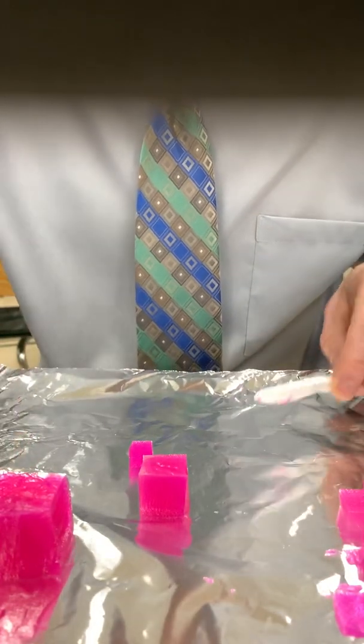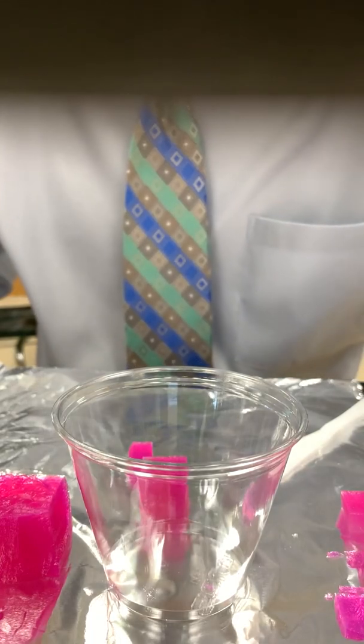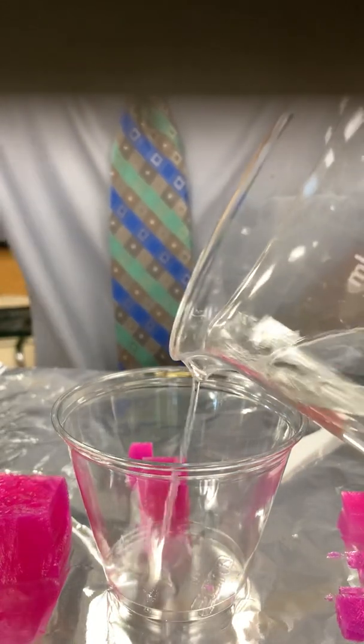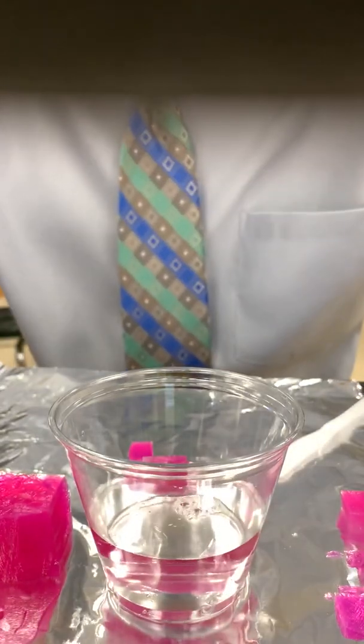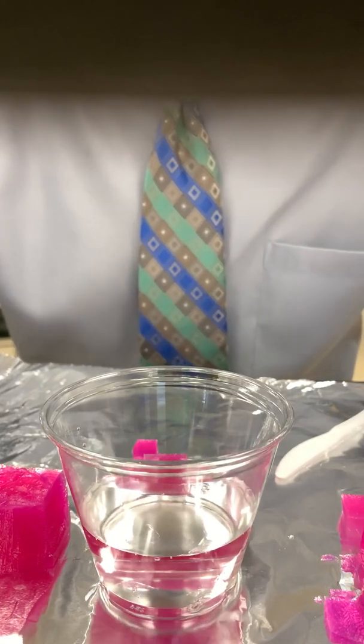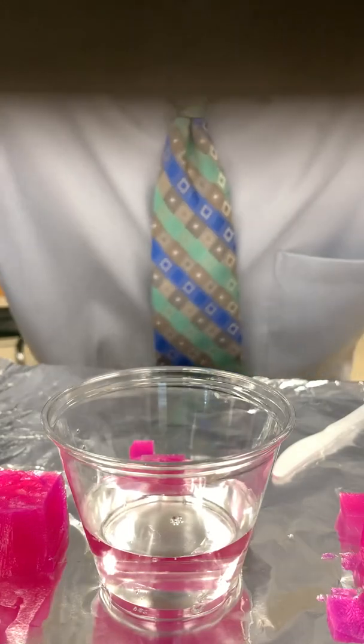So those are our three blocks. Now we're going to take our cup and put hydrochloric acid in there, a 0.3 molar solution. Just enough so that when submerged, the cubes are in the hydrochloric acid solution.